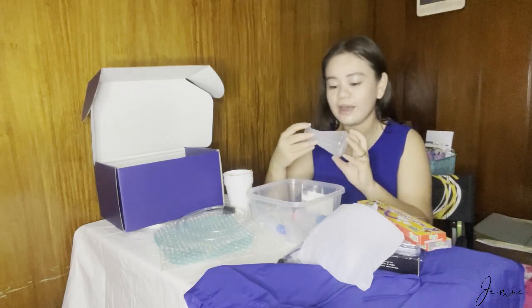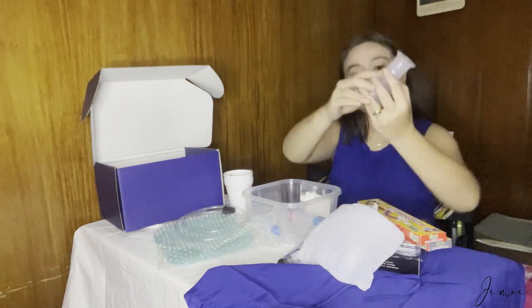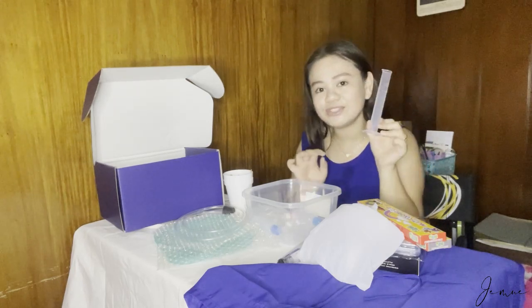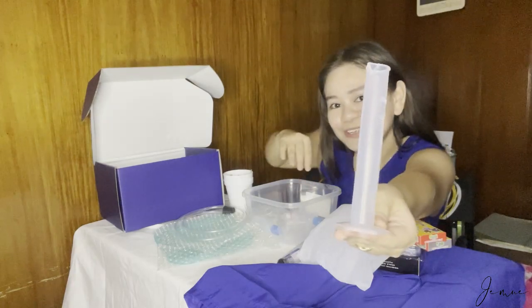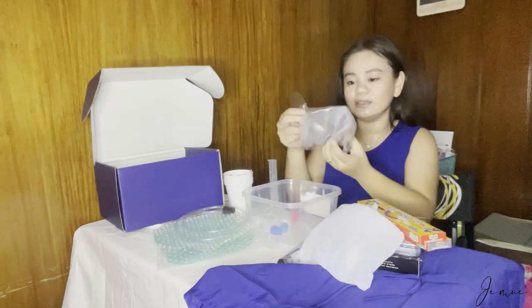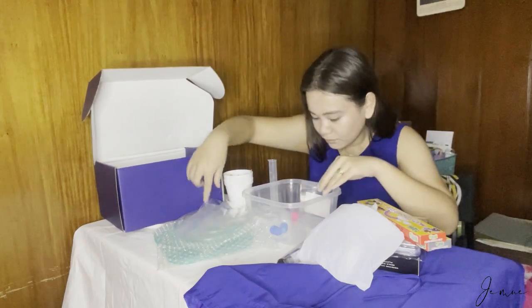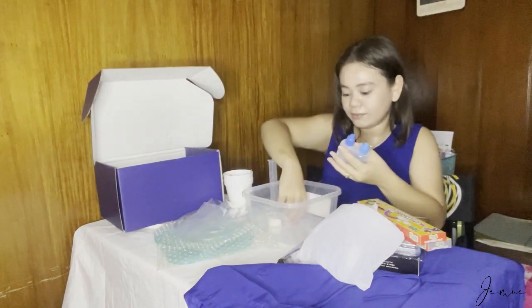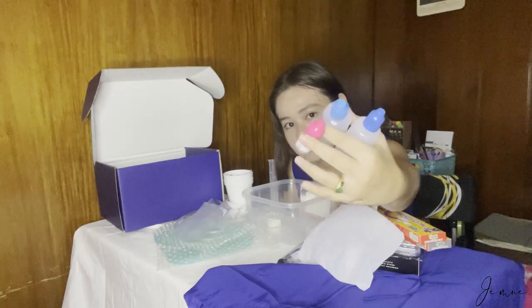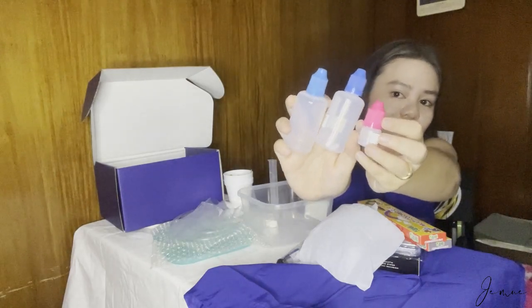We also have a plastic flask — ayan, nakakita ako ng plastic na ganon. We also have a graduated cylinder. And we also have a pair of plastic gloves. And lastly, we have dropper bottles — isang maliit and then dalawang malaki.